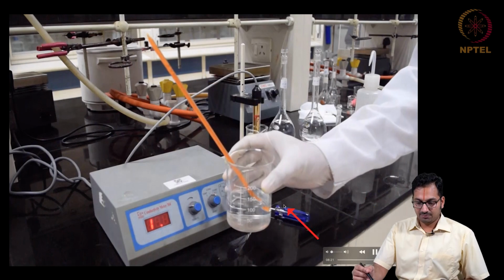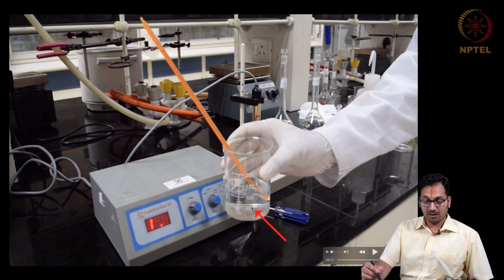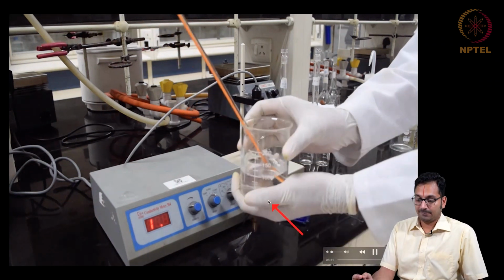As we just mentioned, please ensure that you measure the temperature at which you are making a measurement, and it's a good idea to always put the thermometer within a water bath such that equilibrium measurements can always be taken care of.